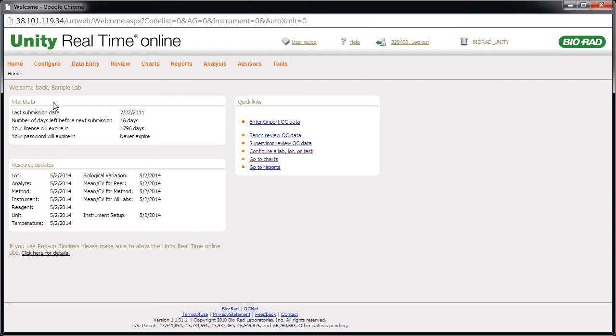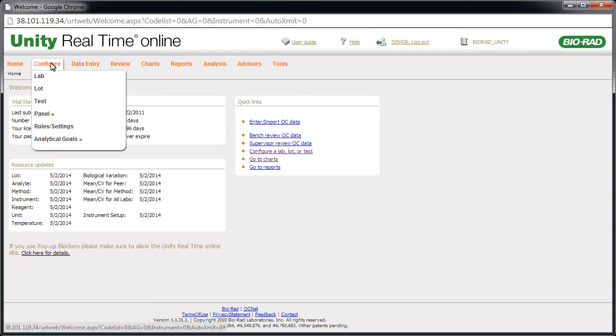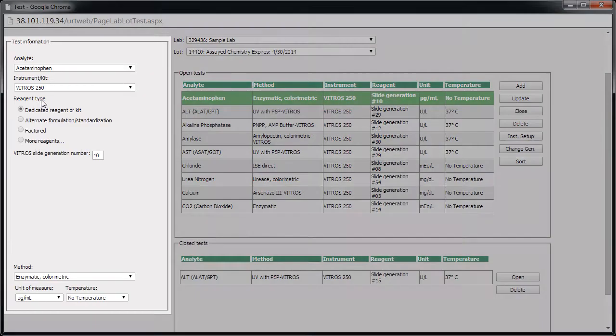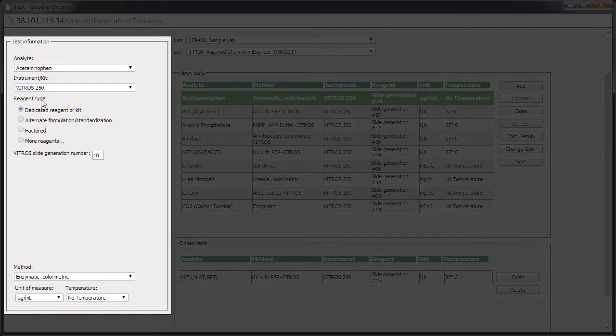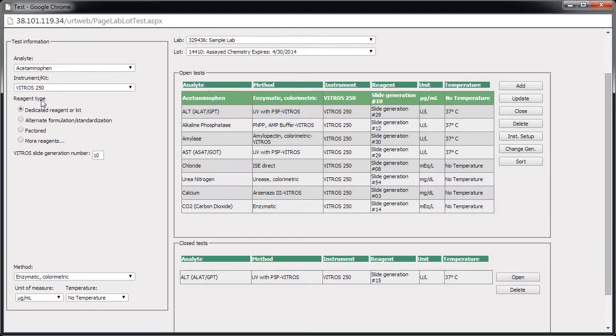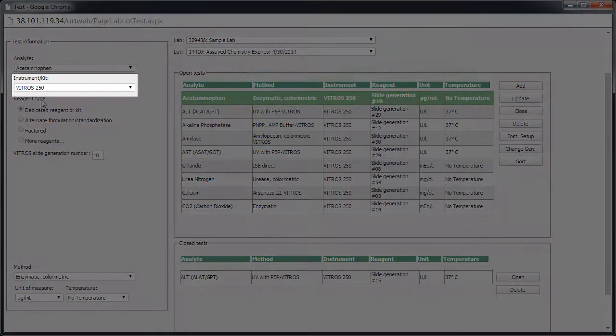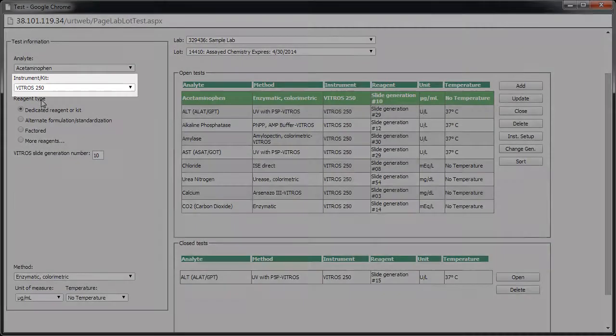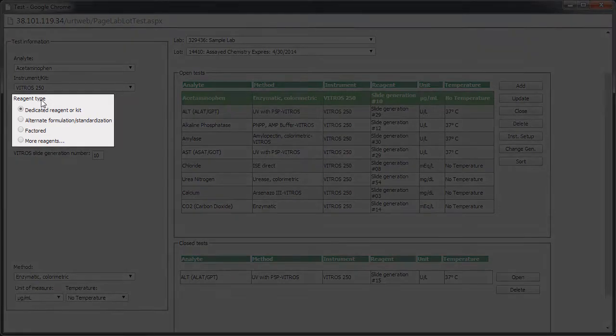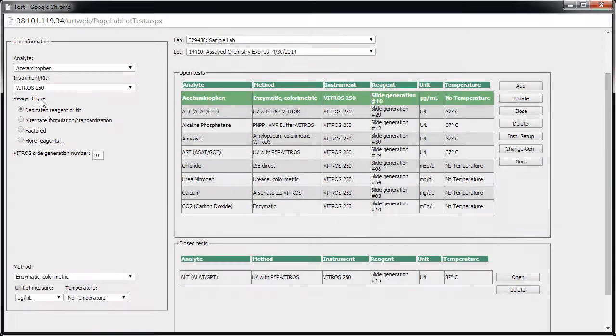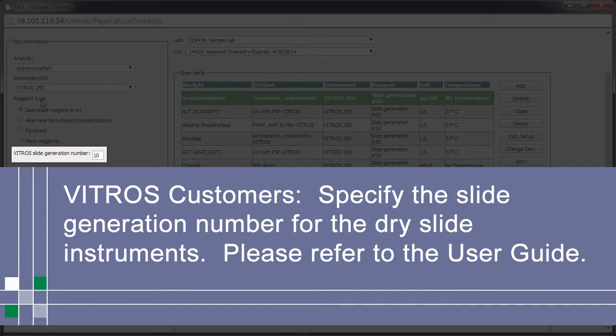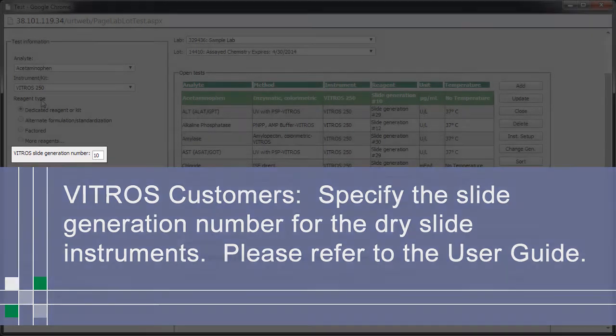Point to Configure and click Test. This is where you can select the test and its attributes. You'll also need to select an instrument and reagent. Note, Vitros customers also need to specify the slide generation number for the dry slide instruments. Please refer to the user guide.